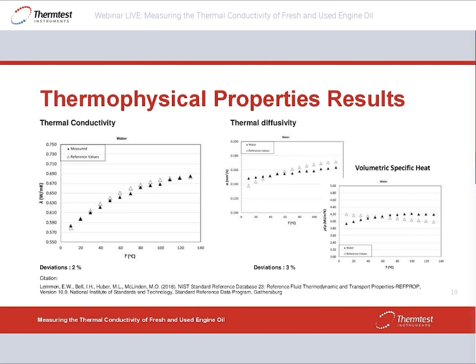Can we use this apparatus to measure thermophysical properties of a ceramic sintered sample? If this is, I'm not sure if it's solid. No, it's not suitable for solid measurements. If it's powder, yes, it could possibly be used with a powder cell. But to tell you the truth, if I don't know the sample, if you don't explain it to me, later, if you have any questions, you can drop us an email and we can answer you. If it's a powder, we can measure it, and you can even change the density with a variable density cell. But if it's ceramic, no, you cannot.